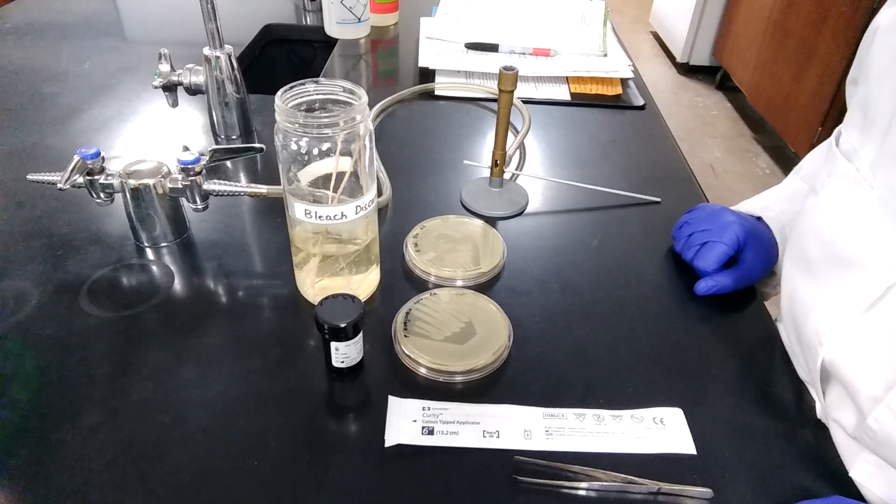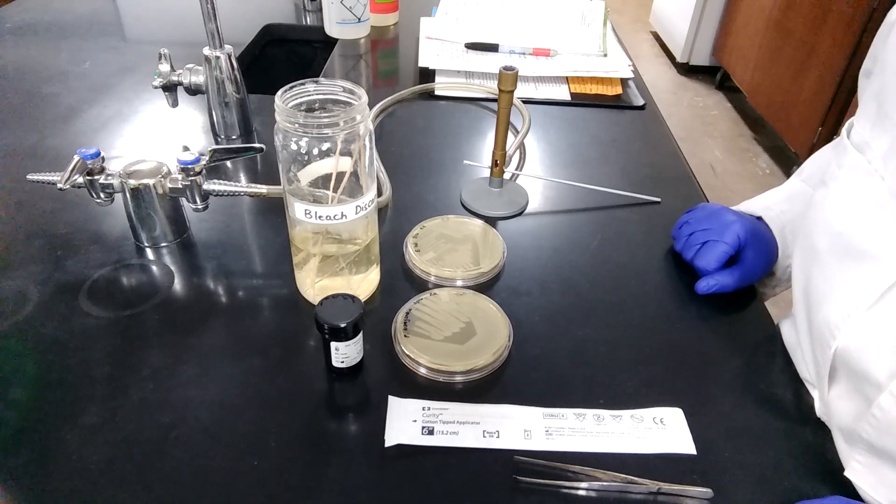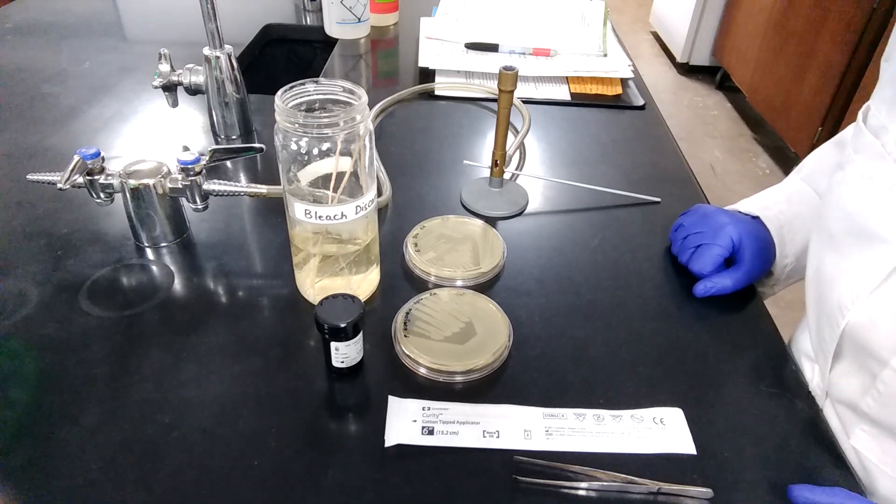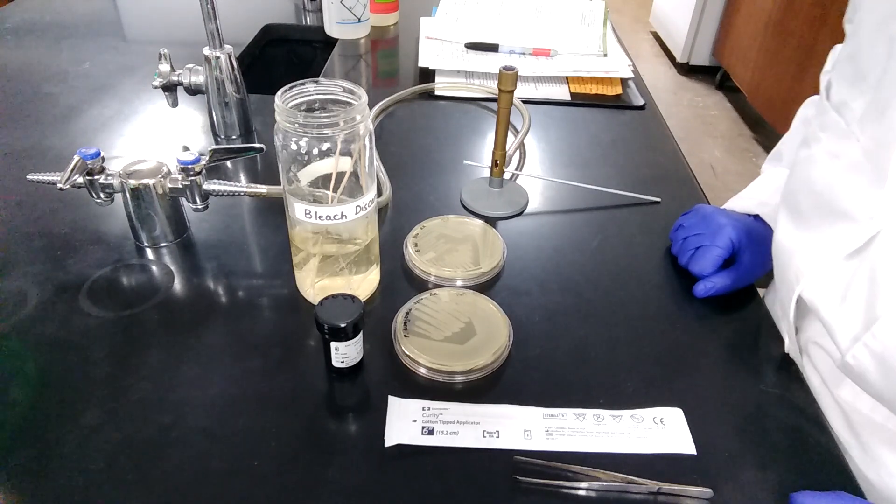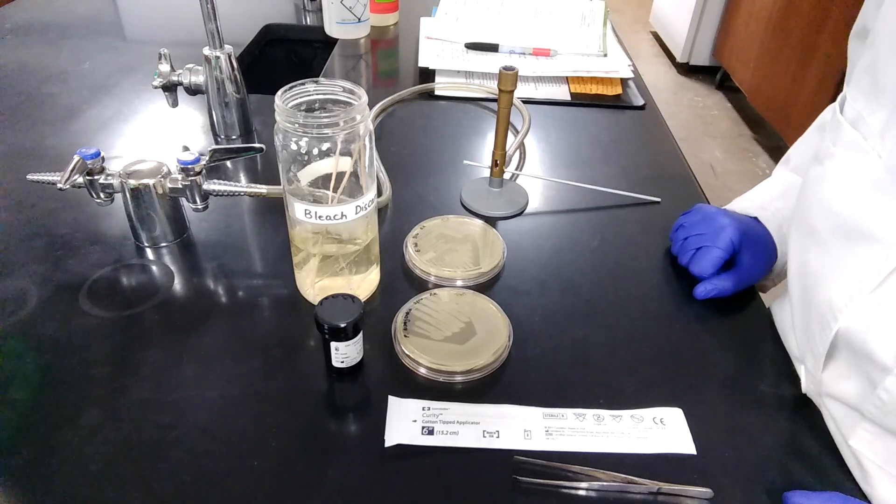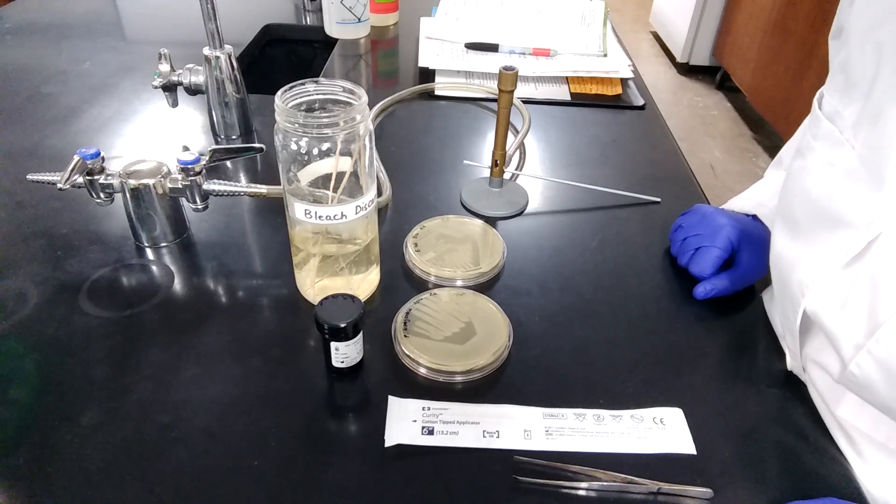However, not all aerobic bacteria can produce this enzyme. Therefore, this test is very specific for those aerobic bacteria that produce the cytochrome C oxidase enzyme in their electron transport chain.